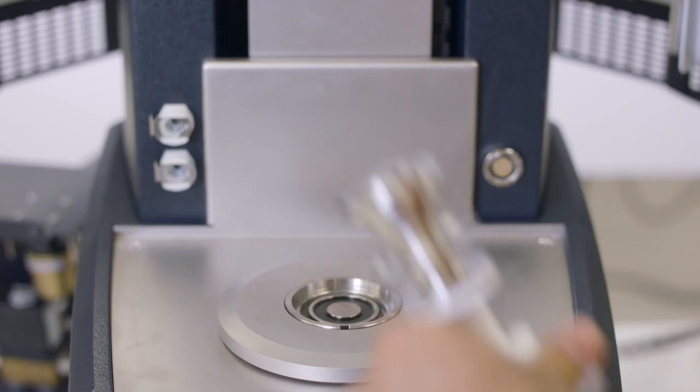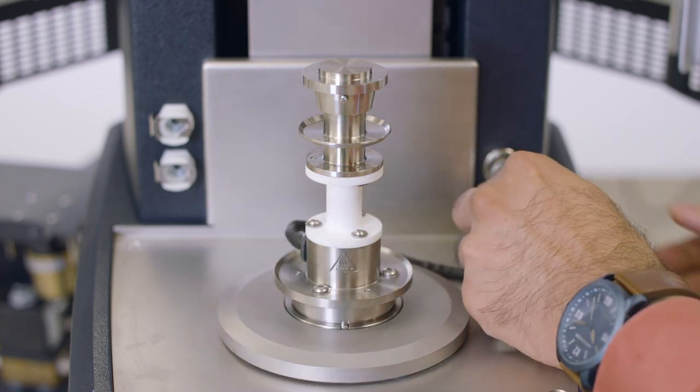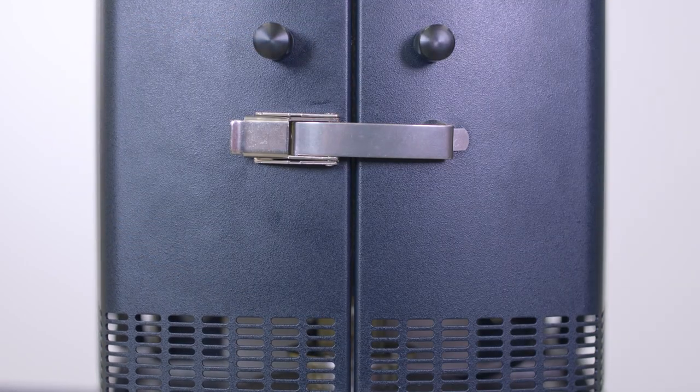To get started, attach the upper and lower 25 millimeter parallel plate geometry to the Discovery Hybrid Rheometer and calibrate the geometry. Close the ETC oven.